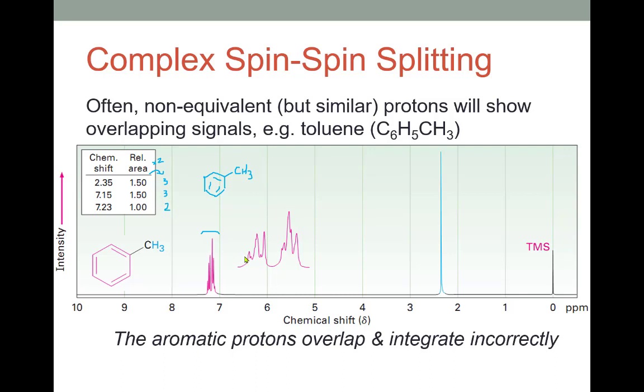Well, remember, if we were to go back and do our substitution test that I talked to you about in the beginning, we would know that the hydrogens sticking off of these positions are different to one another. We would guess that the hydrogens at the shoulder carbons next to the methyl group are the same.